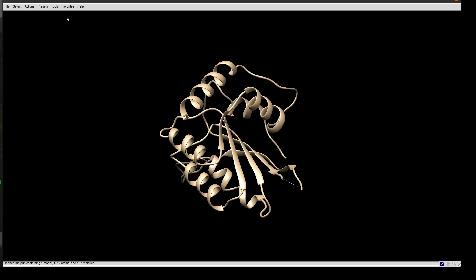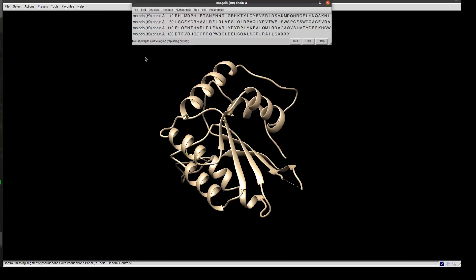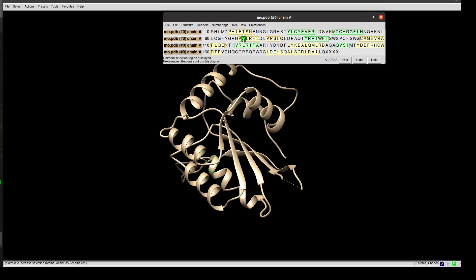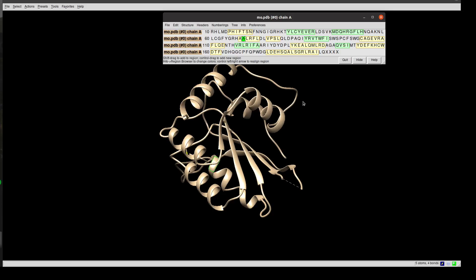To do that, we'll show the sequence from Favorites > Sequence. Here is the sequence of your protein. Since I have only one chain, it shows chain A immediately, but if you have multiple chains, you'll have chain A, B, C, or whatever, and then you select. If you mouse over this residue, you'll find it appearing down here. It's alanine 72, so click and drag it. Now I've selected it.